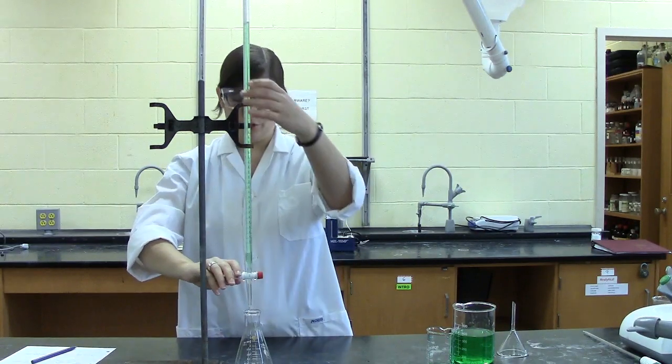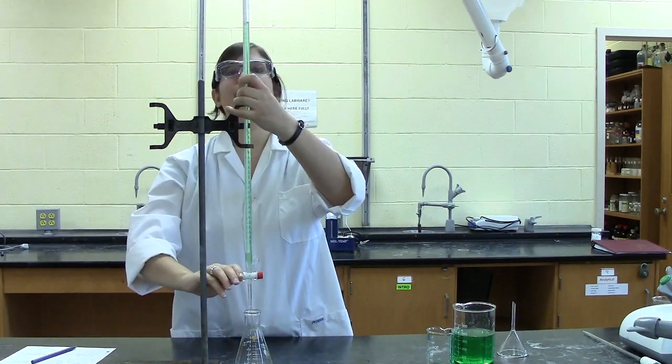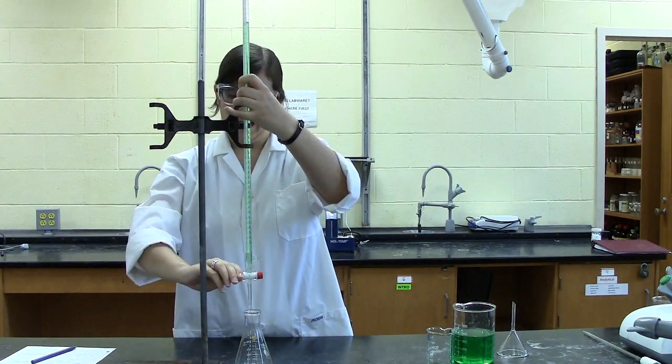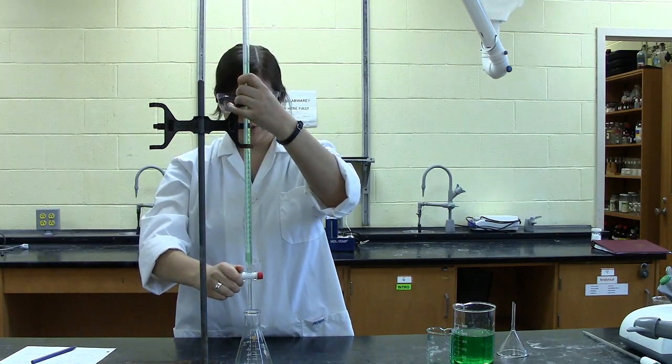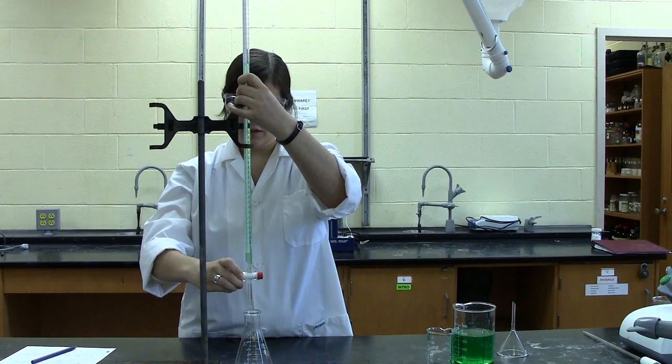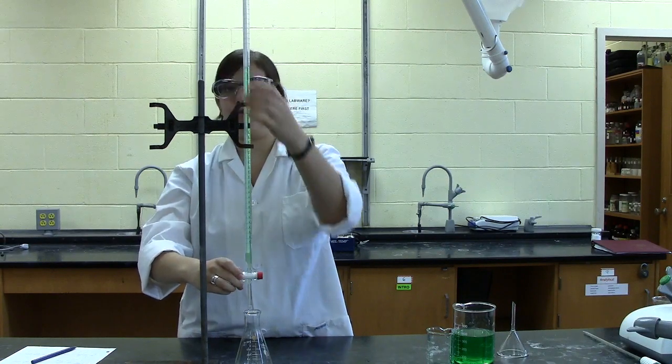As you're dropping your solution into your Erlenmeyer flask, if you know what amount you want to add, you can start by going quickly, and then as you get closer to whichever amount you know you need, you can close the valve most of the way to go drop-wise.